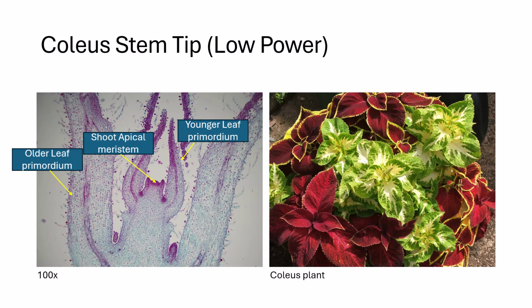You will have different stages of development. These lack the full differentiation of tissues like vascular bundles, mesophyll layers, and epidermis with stomata that its mature counterparts have. It also has not expanded to perform photosynthesis yet. You can also see trichomes, or hair-like structures, visible along the outer edges of the developing leaves.